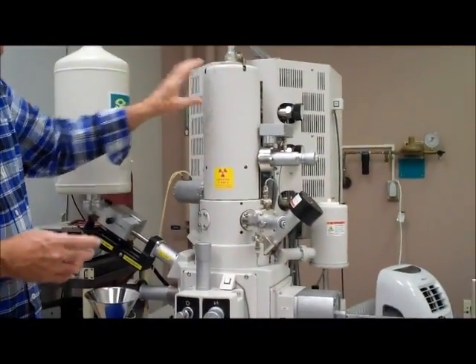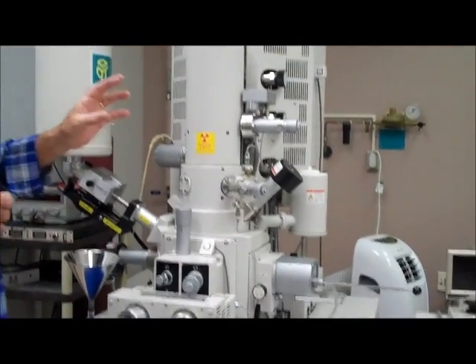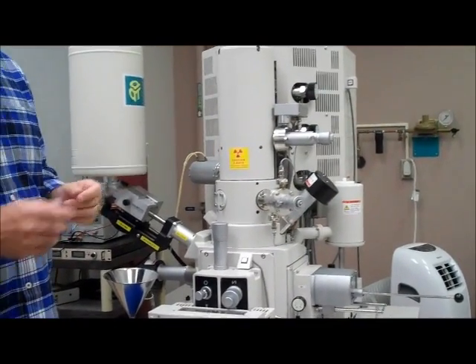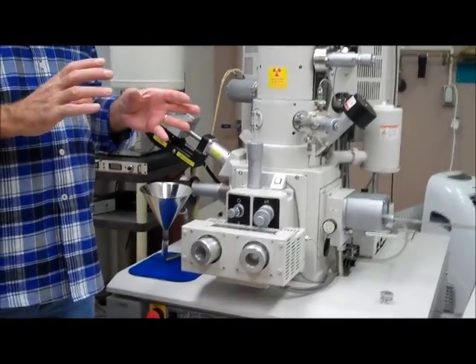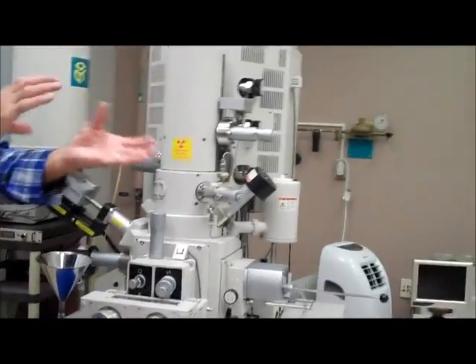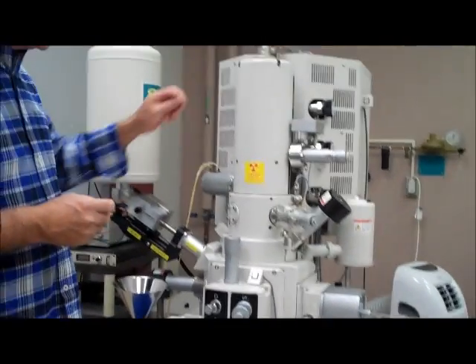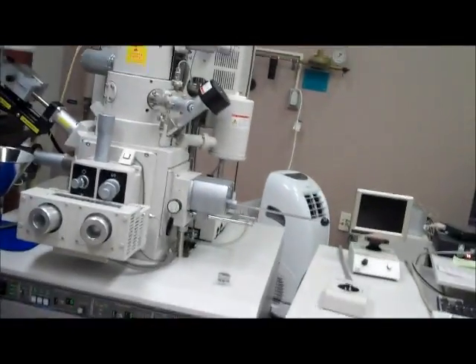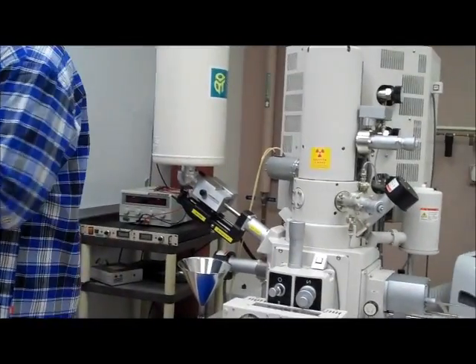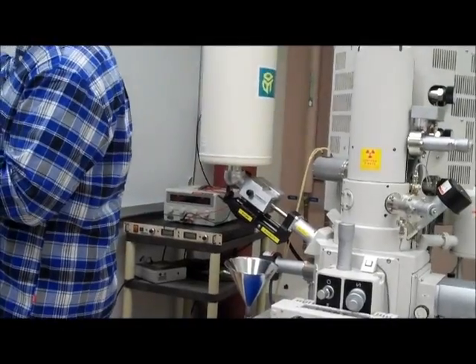At the top of the column is the electron gun, and so this is a special electron gun that's called a field emission gun, and it works a little differently than older microscopes or other microscopes. This one has an extremely sharp point on the end of a tip, it's called a tip.